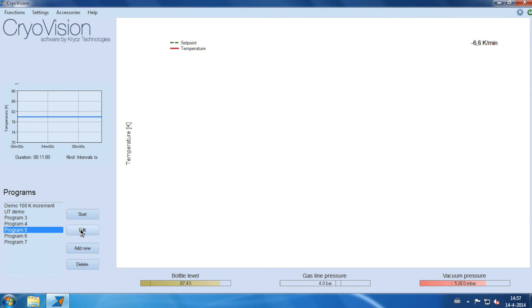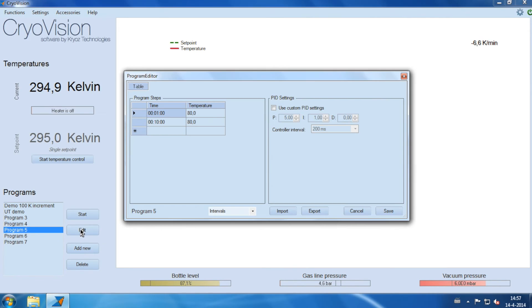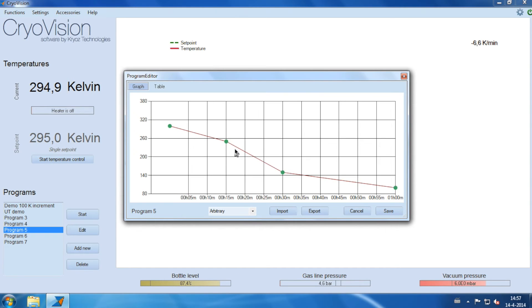In edit mode, you have three options to edit a program. Arbitrary. Here you simply draw a curve.